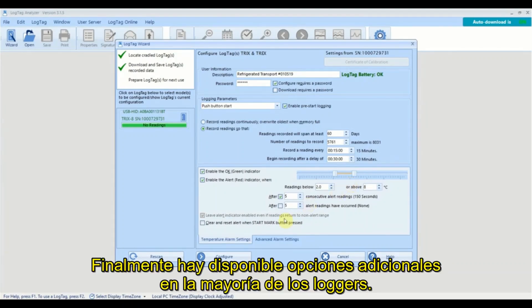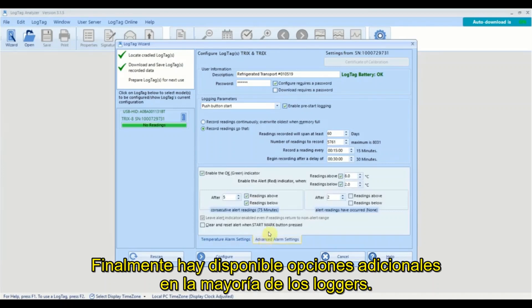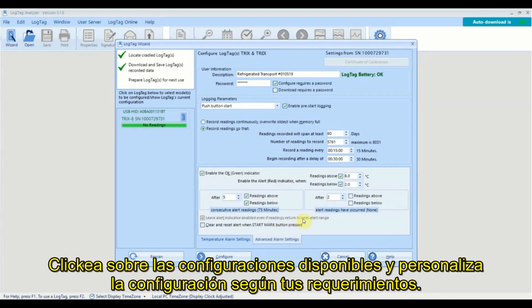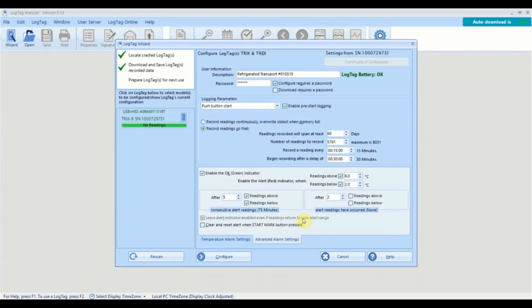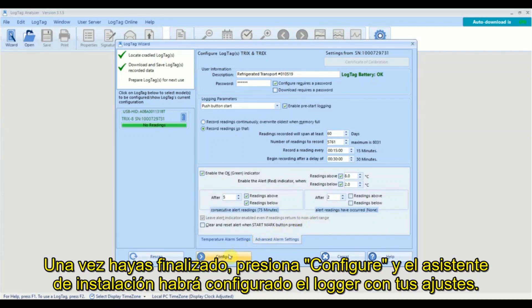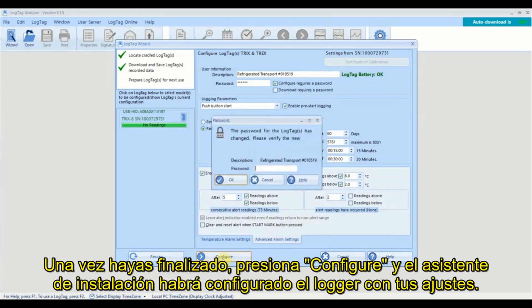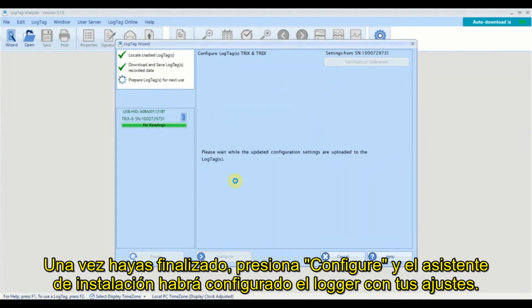Finally, there are additional options available on most loggers. Click on the available tabs and customize the settings to meet your requirements. Once you are ready, click configure and the wizard will configure your logger with your settings.